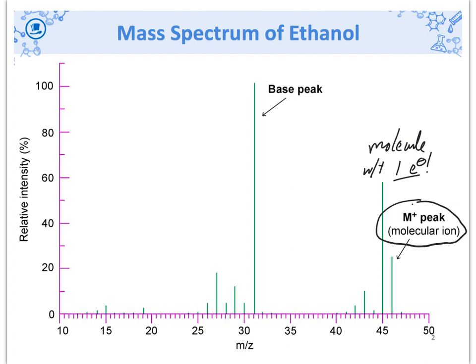So I always think about this molecule getting into a brawl, a fight with this electron beam. The first thing the electron beam is going to do is shoot an electron at it. It's going to knock out a tooth, and that's like one electron being knocked out. But if I lost a tooth, that really doesn't change my mass. So if the molecule mass was, in this case, 46, losing one electron won't really change its mass. Electrons don't have much mass.